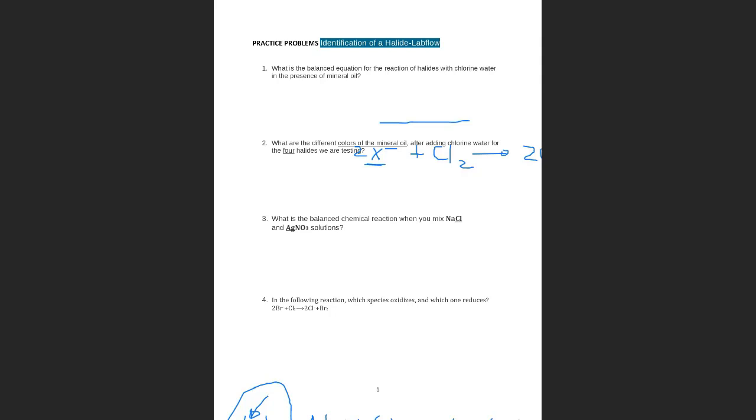You're going to see a white solid, a precipitate. And sometimes it's not enough to see the separation of the solid, but you will see a cloudiness. Instead of a clear liquid, you see cloudiness. Both of them are proof that you have a solid. If you have enough, you are going to see the separation of the white solid. But sometimes just a cloudiness is a proof that the insoluble salt is there.